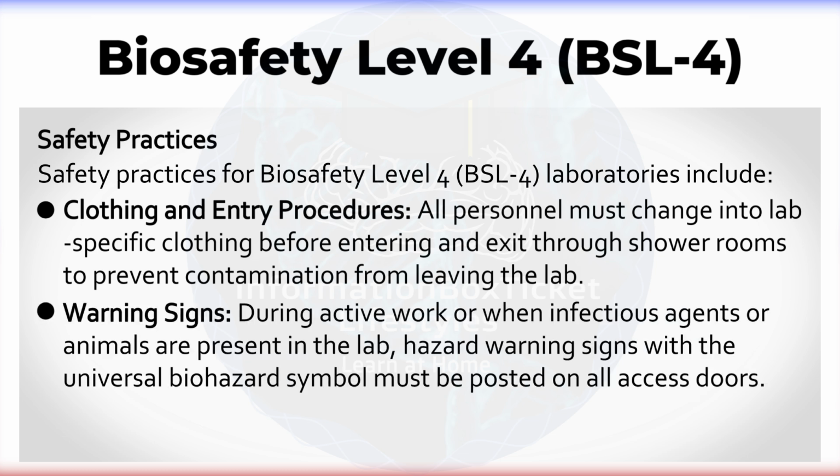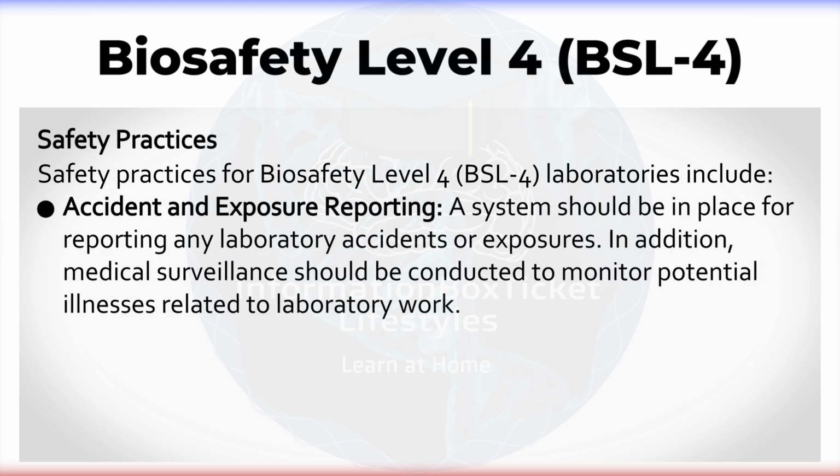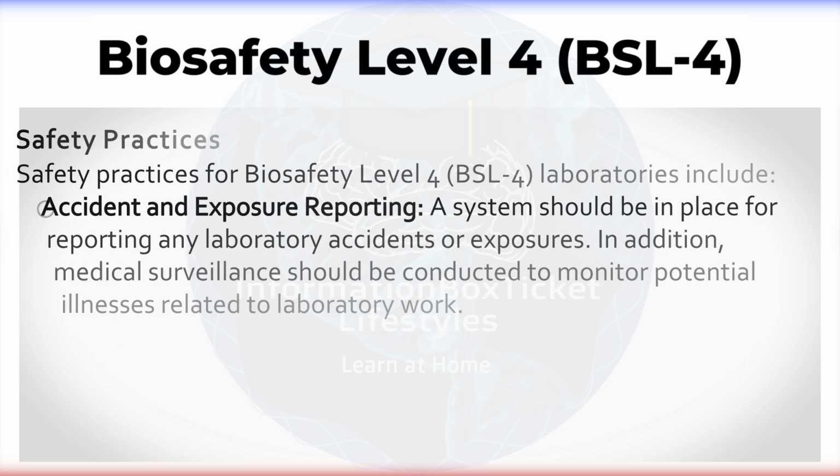Warning signs. During active work or when infectious agents or animals are present in the lab, hazard warning signs with the universal Biohazard symbol must be posted on all access doors. Accident and exposure reporting. A system should be in place for reporting any laboratory accidents or exposures. In addition, medical surveillance should be conducted to monitor potential illnesses related to laboratory work.